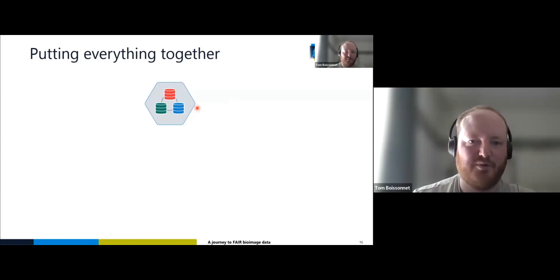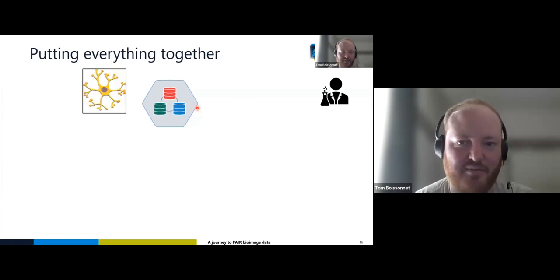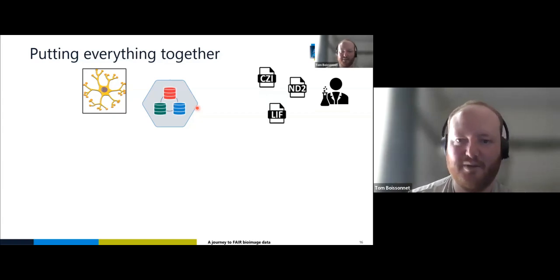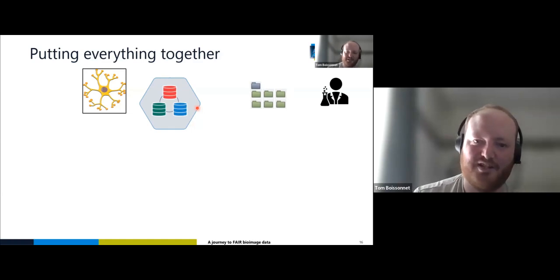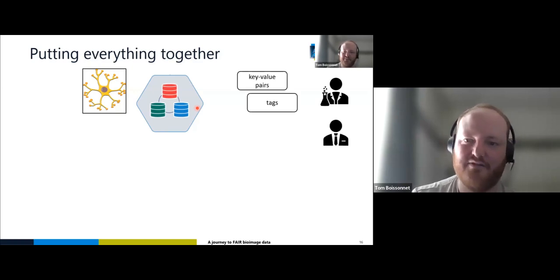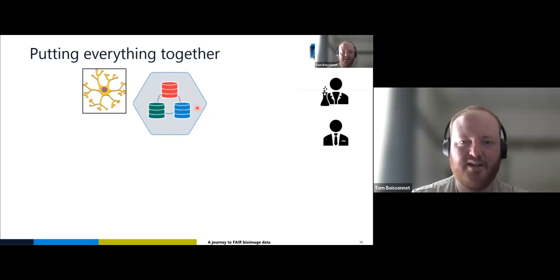So if I try to put all that together, that means someone at the lab would acquire images and upload them to my OMERO server, growing the size of my database. This is not a file anymore. That becomes an image in OMERO. Uploading more images, I increase the size of my experiment, organizing them in projects and datasets, adding some annotation as key value pairs or as tags to organize and make different views. Maybe my supervisor helped me with this job.